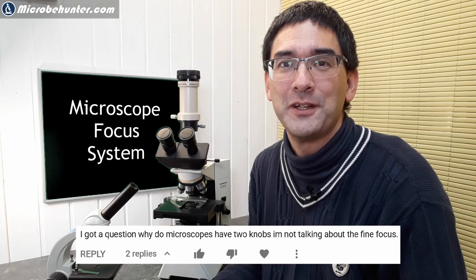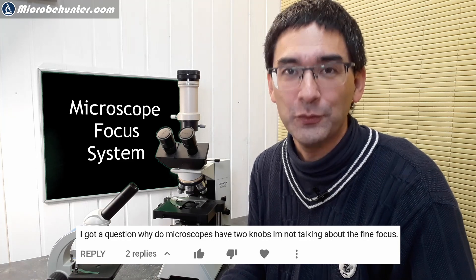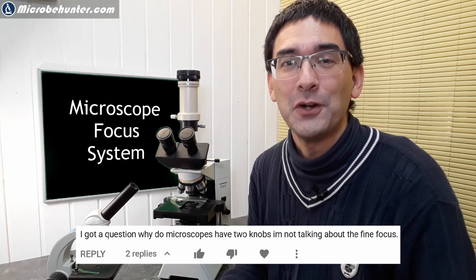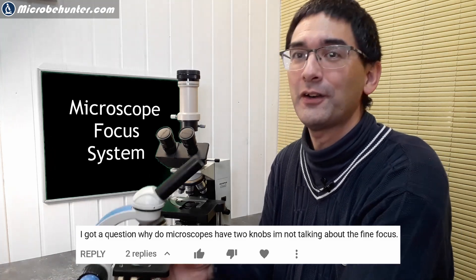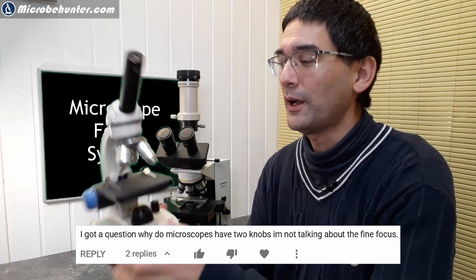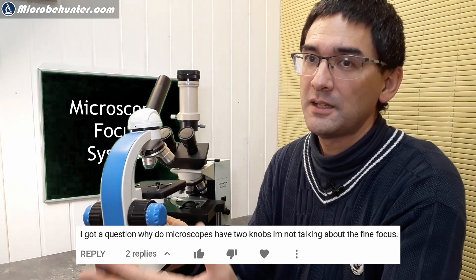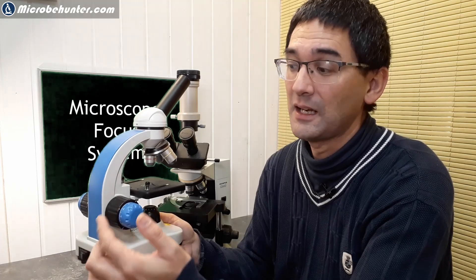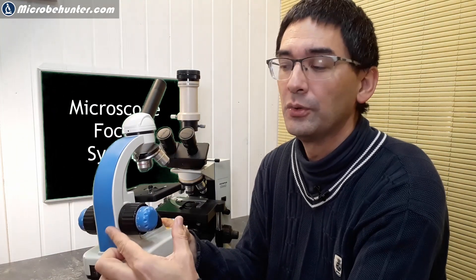Hi, hello, and welcome — Microbe Hunter here again. Today I want to talk about the focusing system of microscopes. I received a question: why are there two focusing knobs in a microscope — one on the left and one on the right side? The viewer was not asking about the coarse and fine focus knobs per se, but rather why there are two at all.